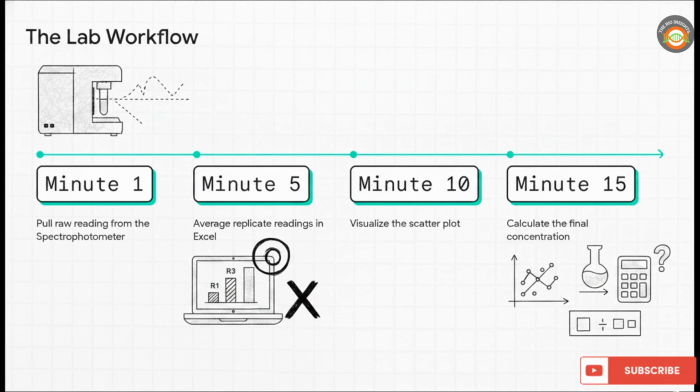To put this all into perspective, let's walk through the actual chronological lab-to-data timeline. At minute 1, you pull your raw spectrophotometer reading. By minute 5, you're sitting at your computer, averaging your replicate readings, your R1, R2, R3 in Excel. By minute 10, you're visualizing the scatter plot. And by minute 15, you're calculating the final concentration.